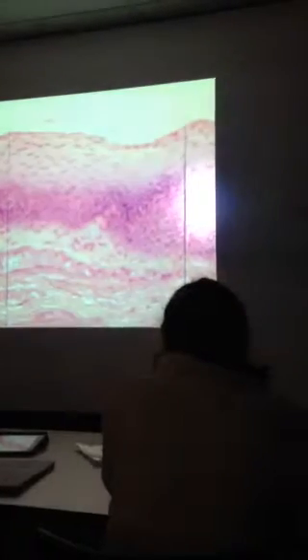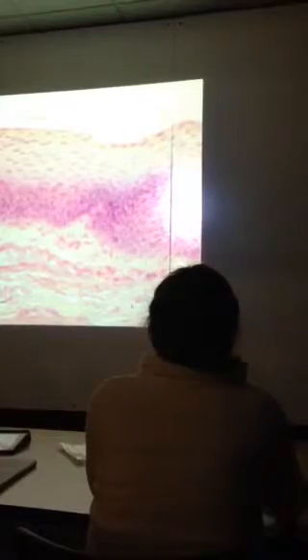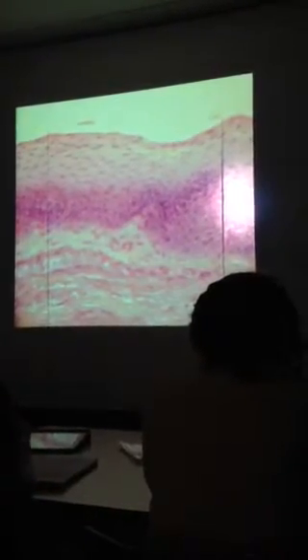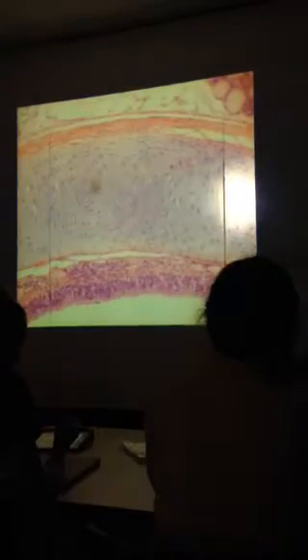All right, what kind of tissue? Moist stratified squamous epithelium again, and I can't really tell you where this is from. I think this is actually from the vaginal canal, but again, there's not enough to really tell, so I'm not going to go for that.